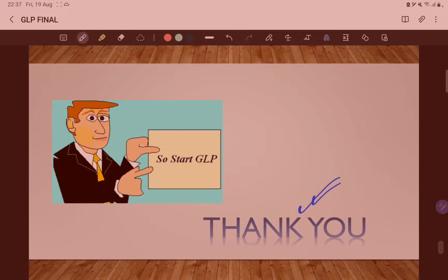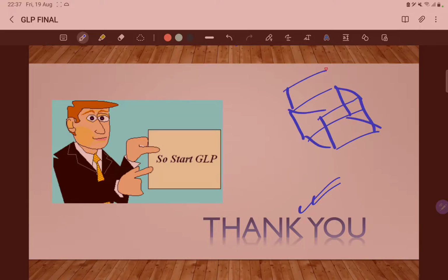Like every industry, even the building of an industry, the plan and everything starts with GLP. If we are making an industry, we should know what space should be given to the labs and everything. So GLP is there in all aspects of the pharmaceutical industry.